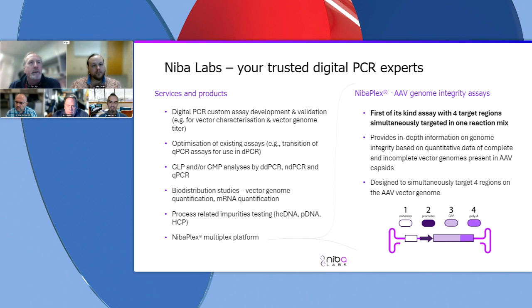Well, I think with the short read, you're going to get a picture of everything that's there. You can piece together a full genome, but you're not going to know if it's actually a contiguous sequence and a full length. I would have to go back to answer your question. I mean, we've just gotten into doing long read AAV sequencing. So this is still a current method that is in development here at SK.